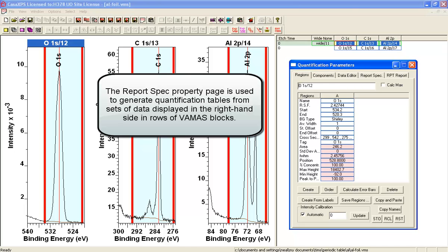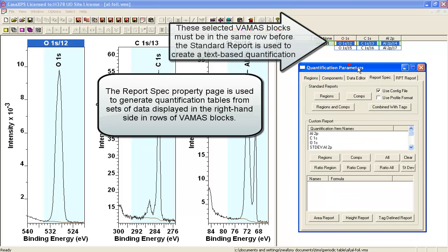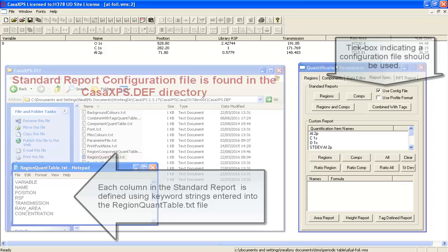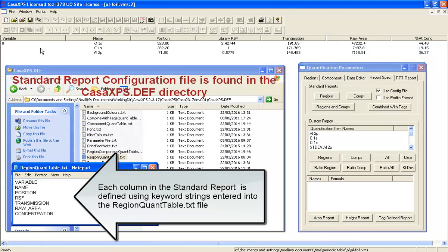Having simply created some regions, the first step might be to go to the report spec page and just select the regions standard report. We've used a configuration file that has output the experimental variable which is 0.